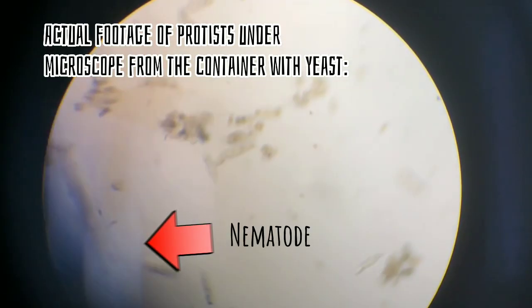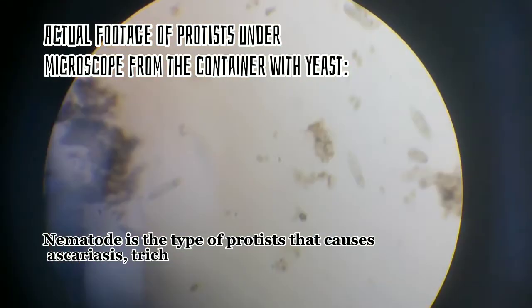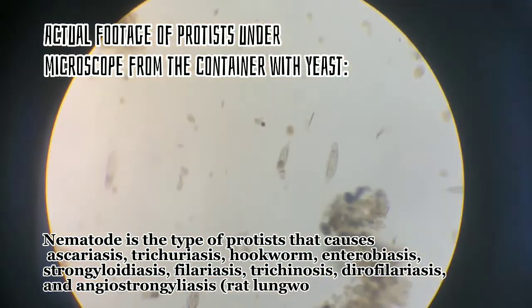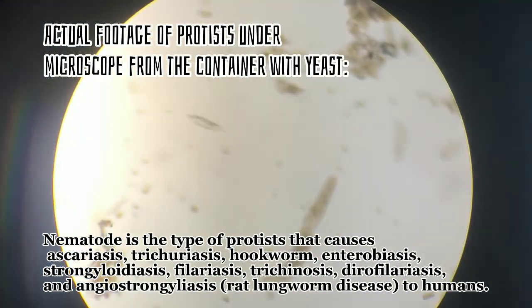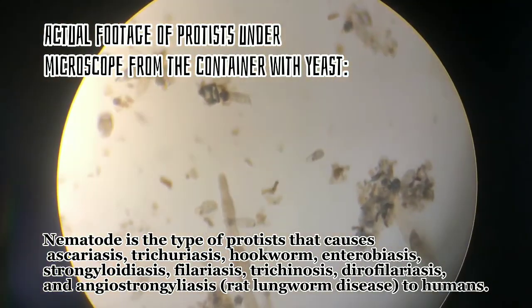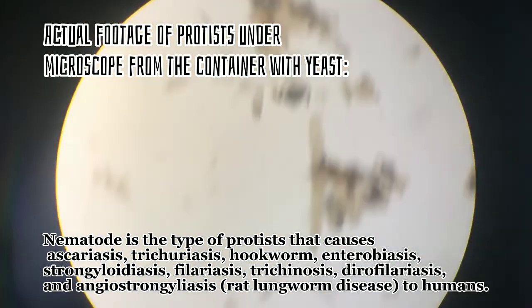This organism is called nematode. Nematode is a type of organism that causes ascariasis, trichuriasis, hookworm, enterobiasis, strongyloidiasis, filariasis, trichinosis, dirofilariasis, and angiostrongyliasis in humans.